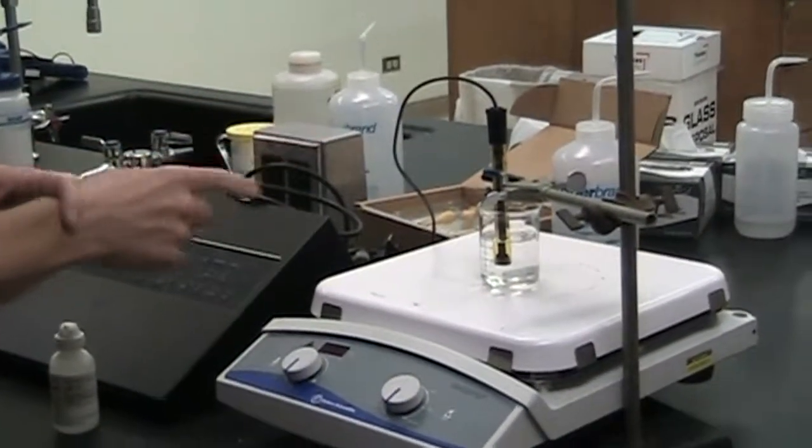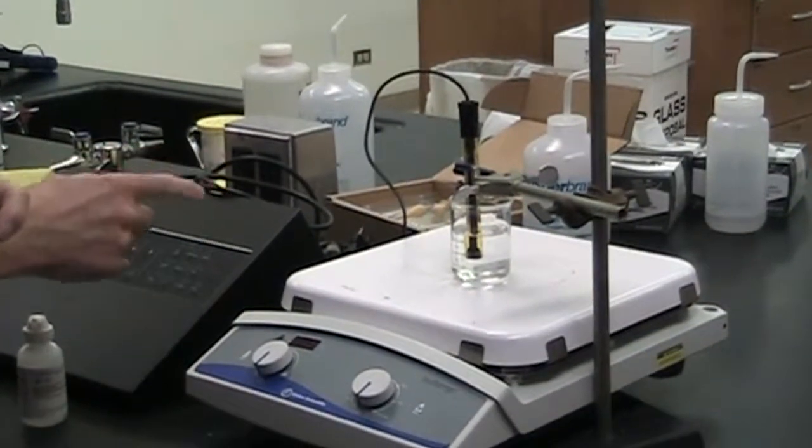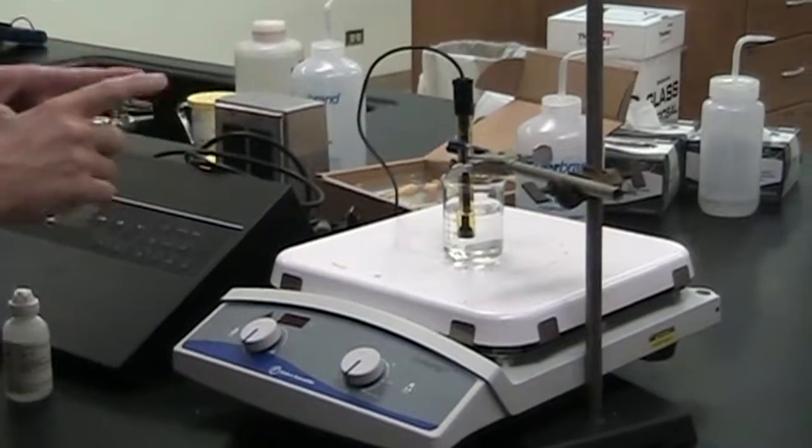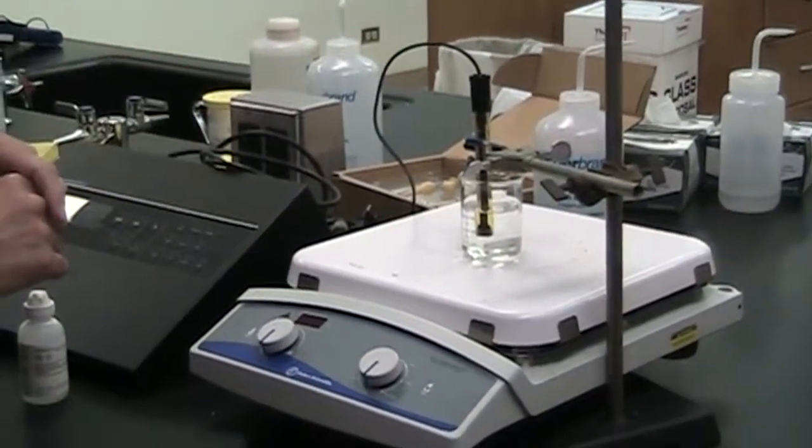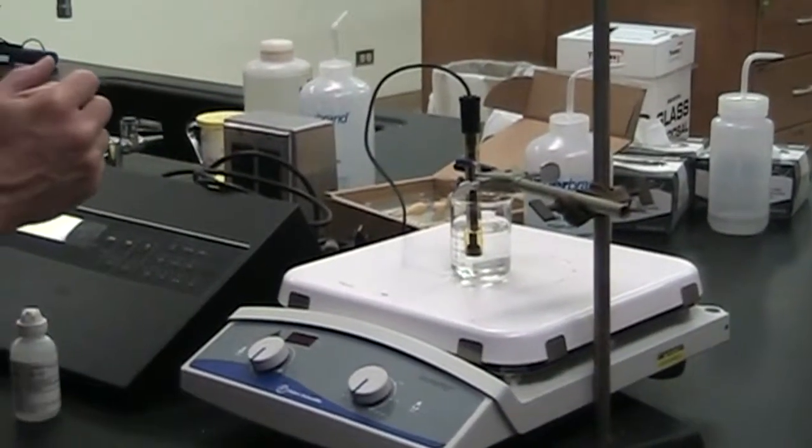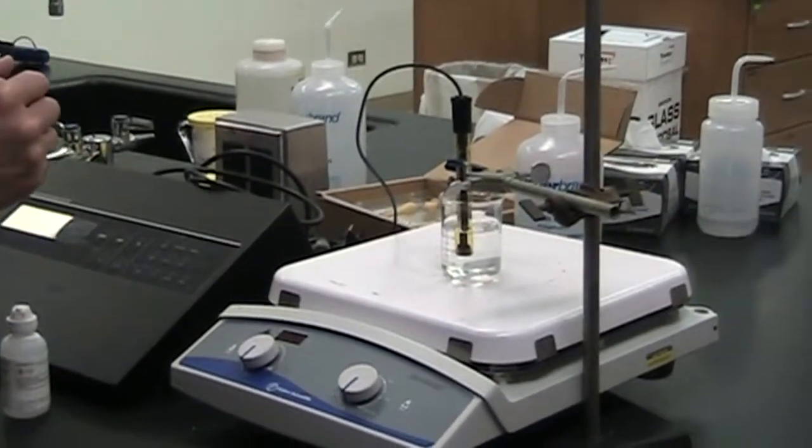All right, so this is our fluoride ion-selective electrode setup. This is a combination electrode, so the reference and the analytical electrode are all in one, so we just have the one body. That's kind of what most people are used to because most pH electrodes will be like that as well.